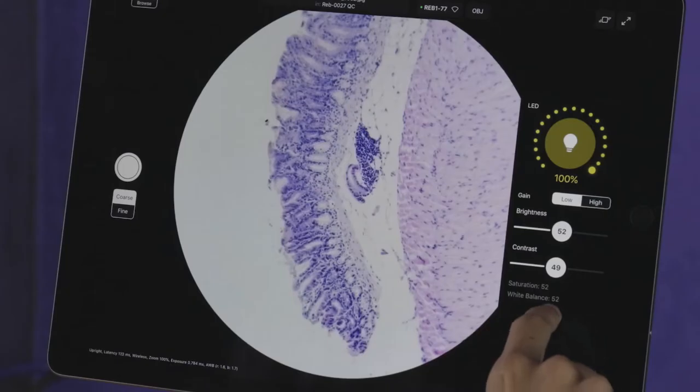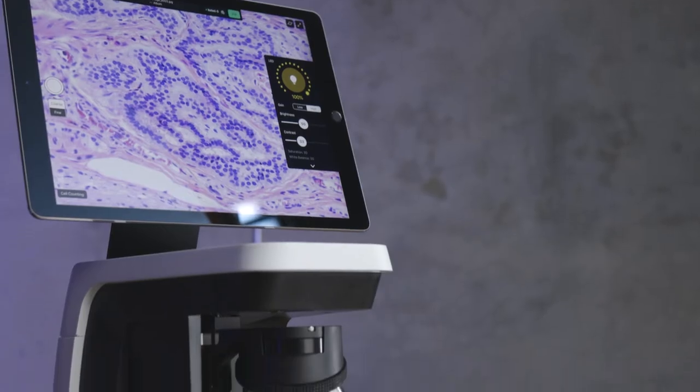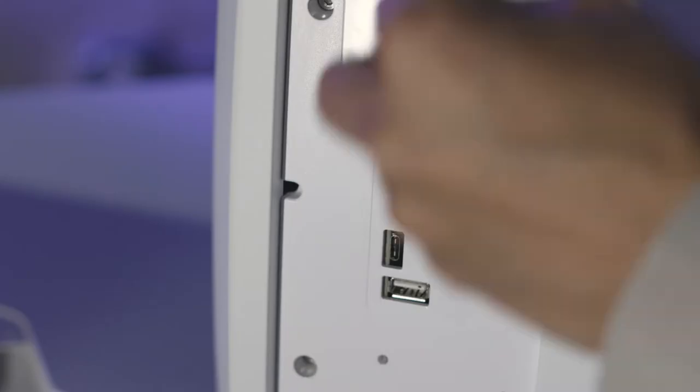We considered every aspect of usability, workflow, and ergonomics to create a powerful yet simple instrument. Just plug in the power and you're ready to image.